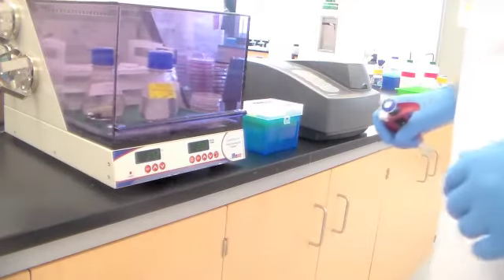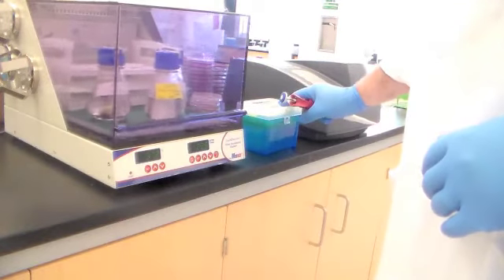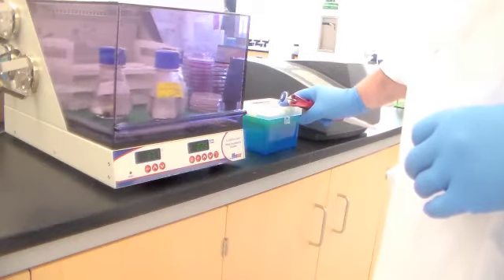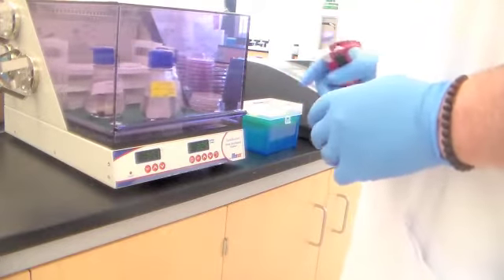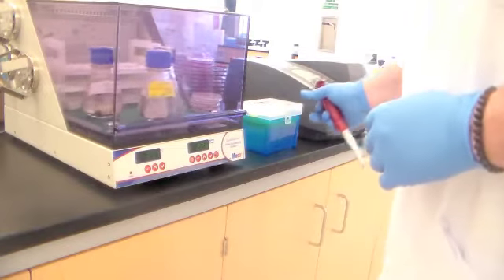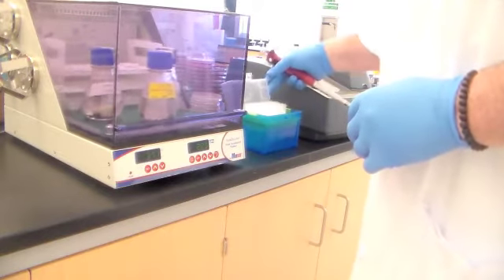Okay, this week in lab, we're going to be doing a diauxic growth curve experiment and also combining that with a viable count. So we're going to be determining the viable number of bacteria in a broth culture. So combining two different principles. There's a handout on the Blackboard site that you should definitely make yourself familiar with before lab, but also just to help you prepare for this.